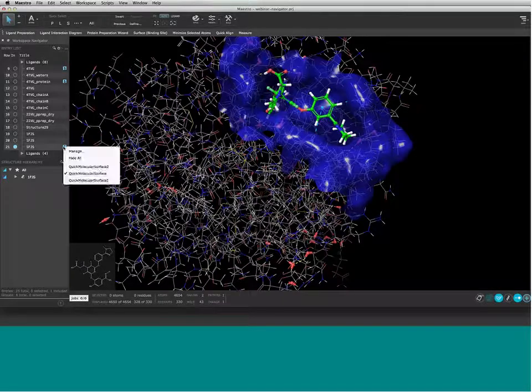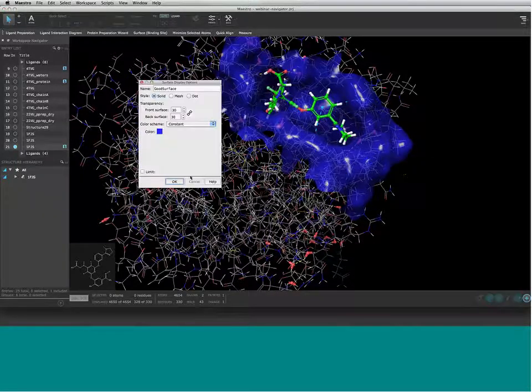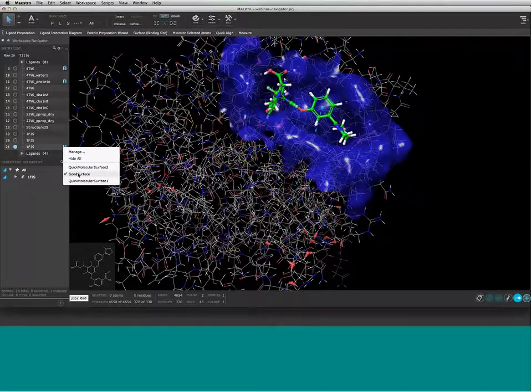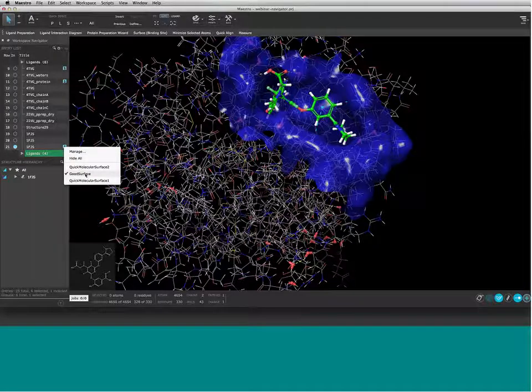And there's a couple other objects in that menu too. Now you can see when you go over to click on the S in the entry list, you'll have your new name. And within the right-click menu, there's also the ability to hide a surface or delete it. You can also get back to it through the S panel, or you can pop up the Manage Surfaces panel to manage all the surfaces from all your entries. And that might bring up a familiar tool.